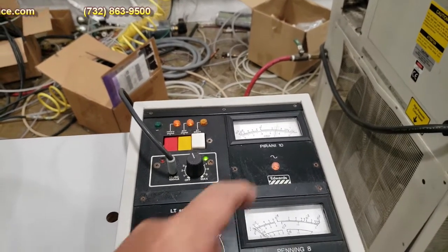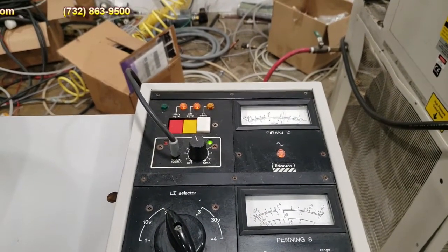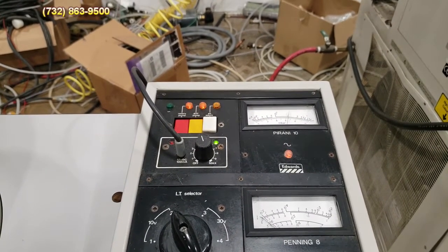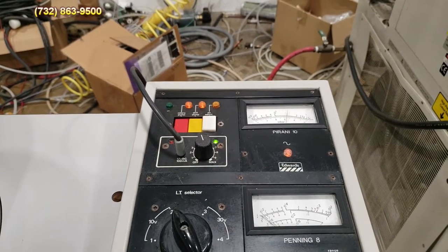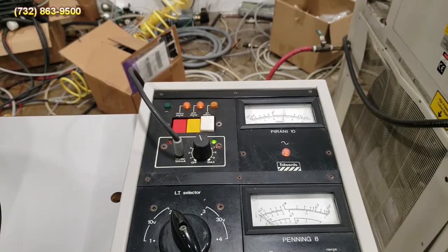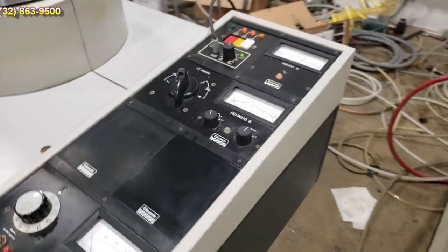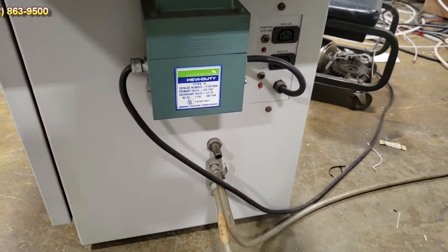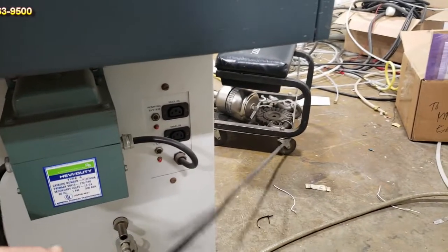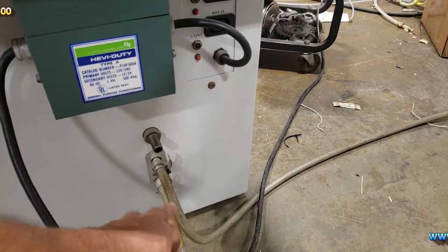We're going to wait for this to basically drop around 100 millibars. Your hookups are on the side here — your power cord which will have a plug on it, and then you have your vent, and then you have your in and out for your water.